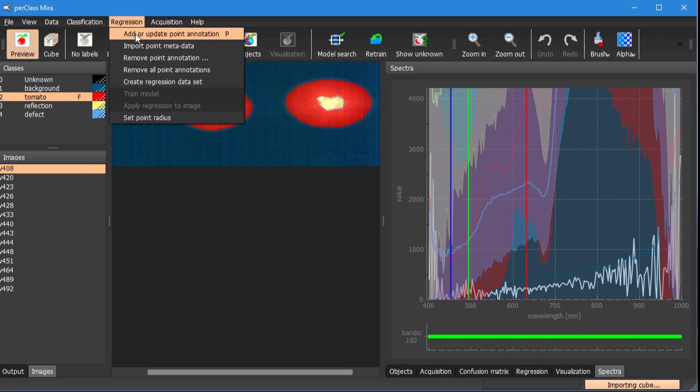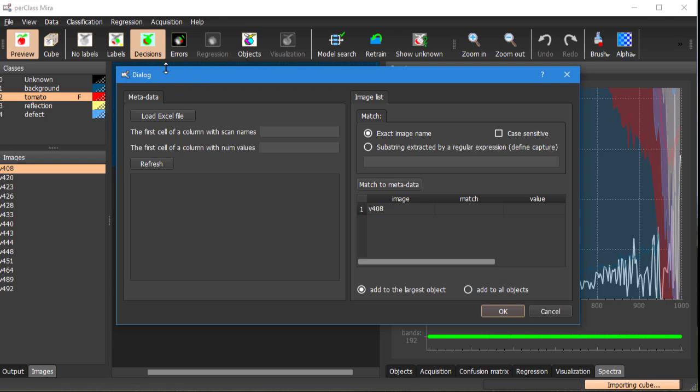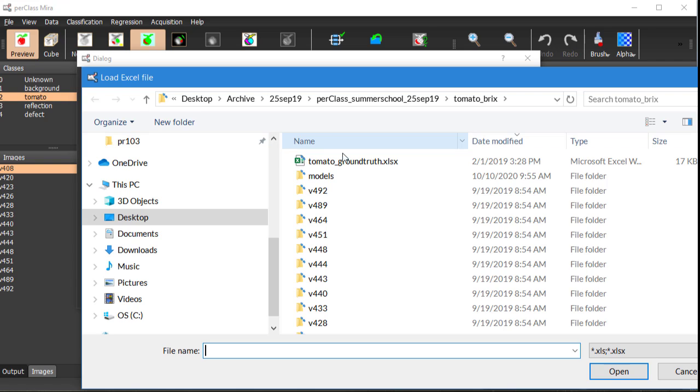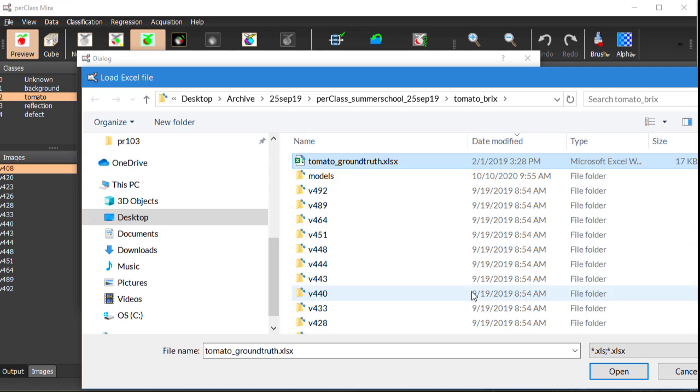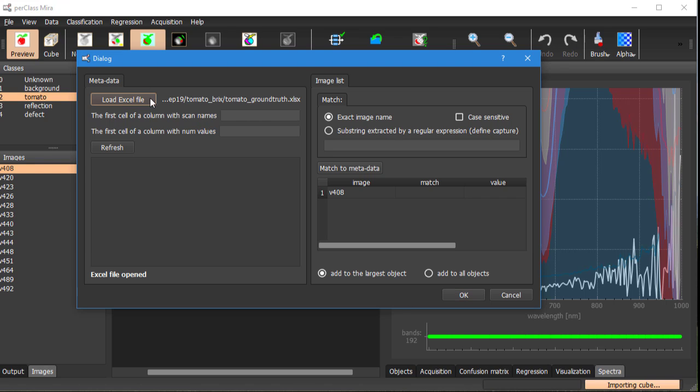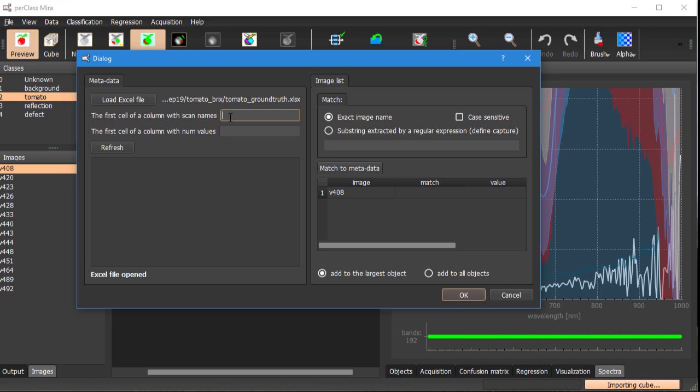So we go to our import dialog and here we have two separate parts. On the left side we can specify the metadata file, the excel file, and we can point out to the area of the excel file that contains the scan names and numerical values.